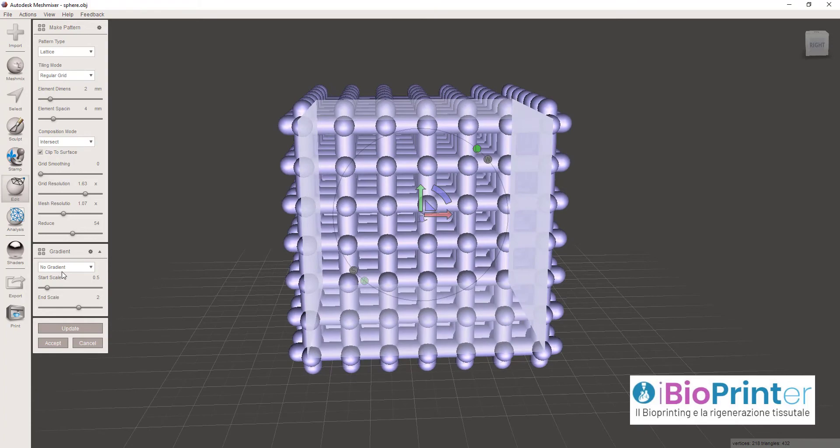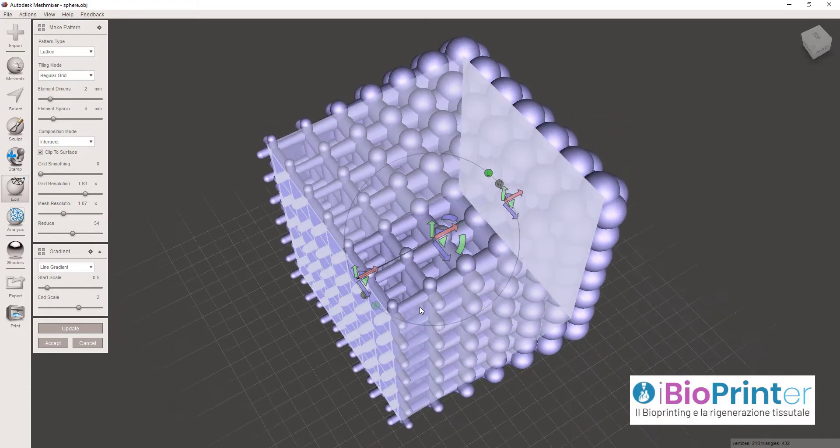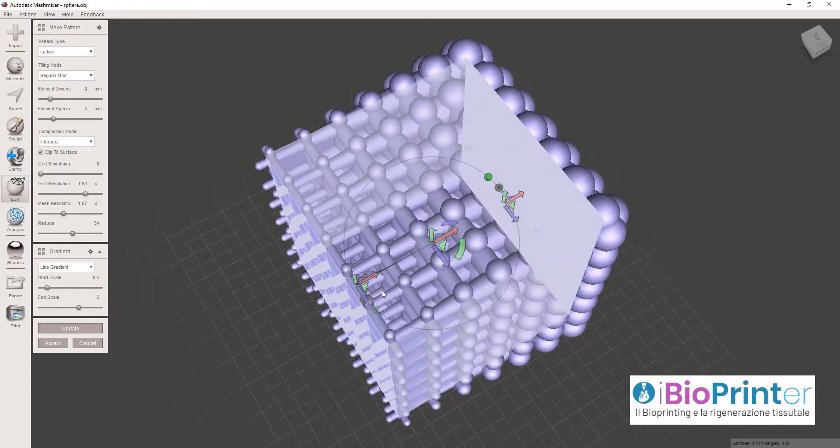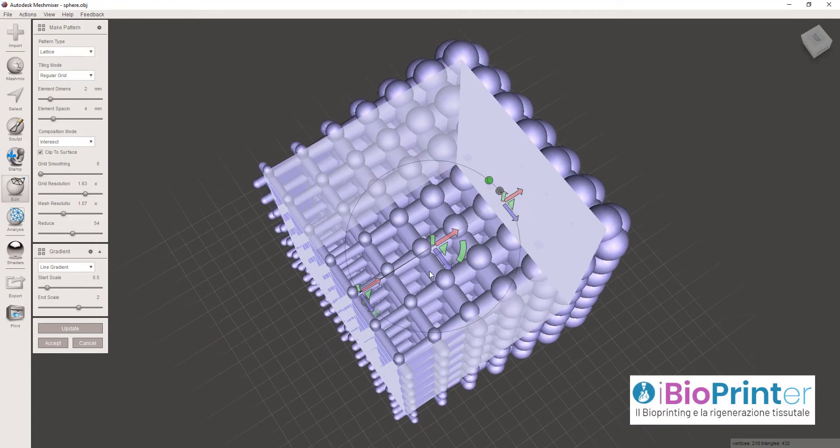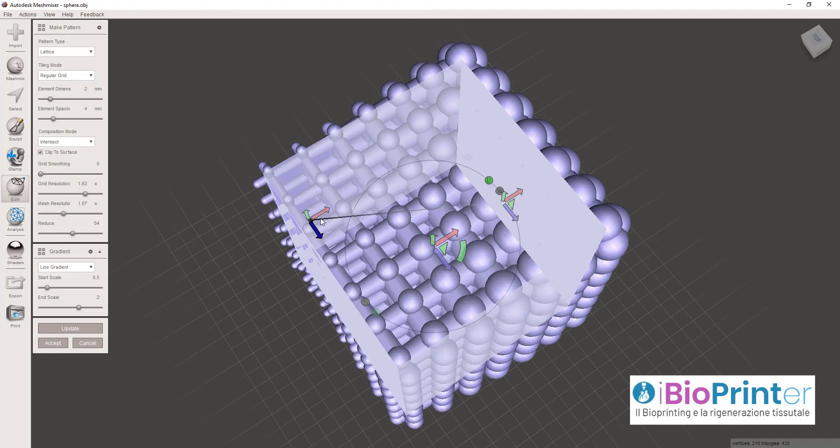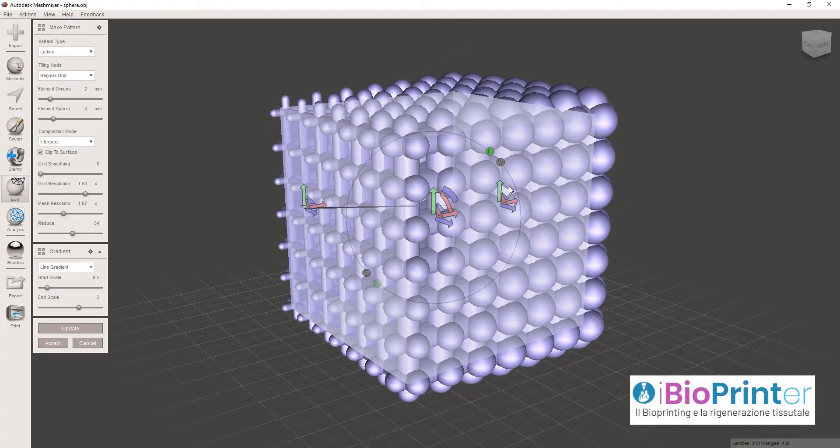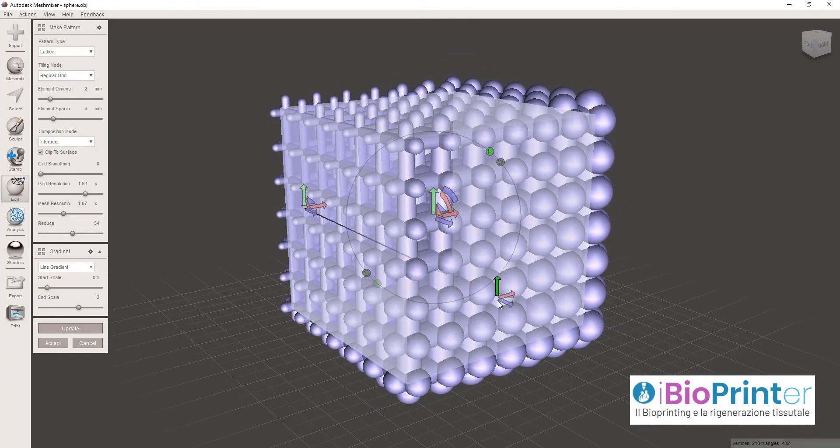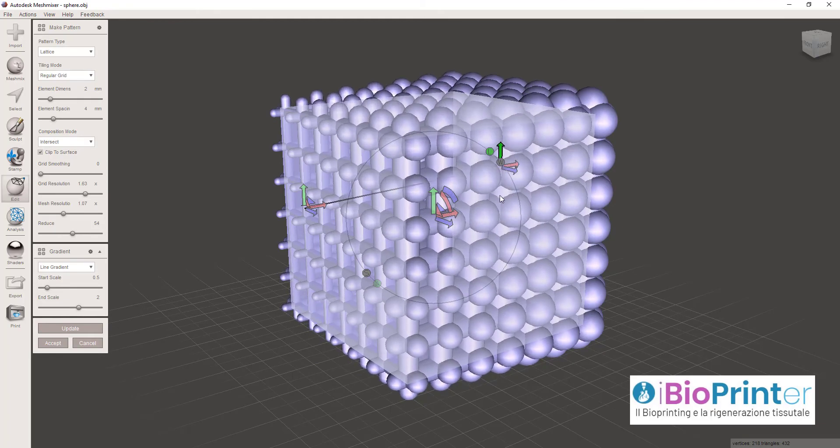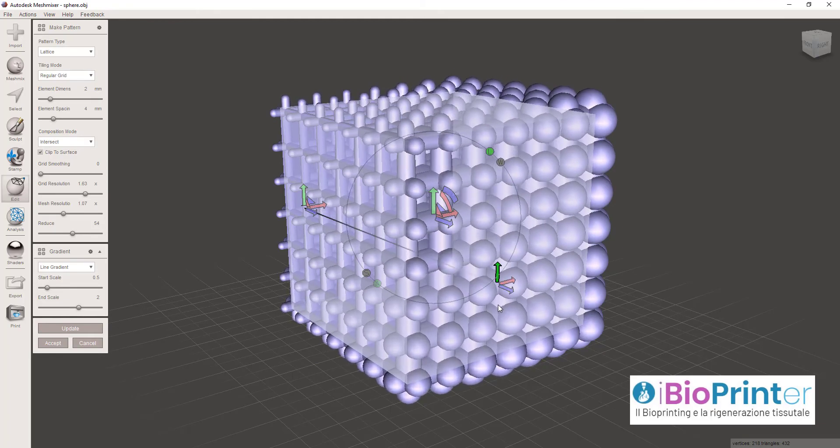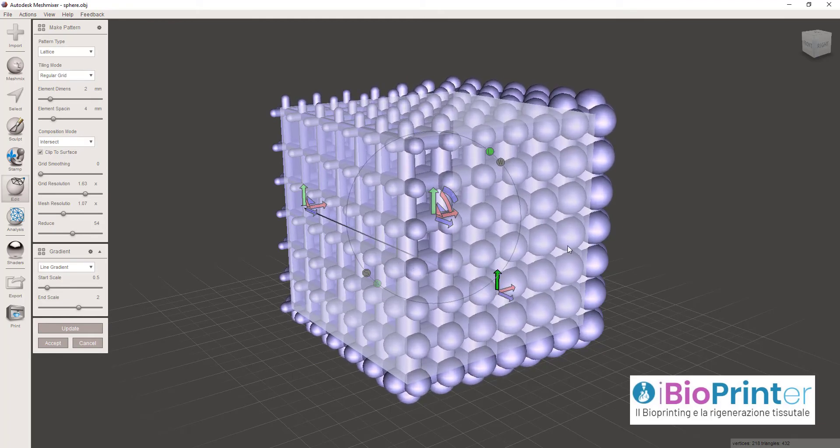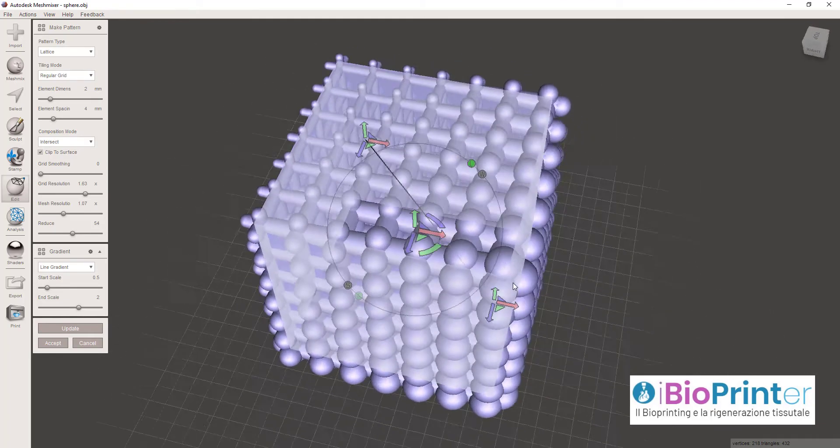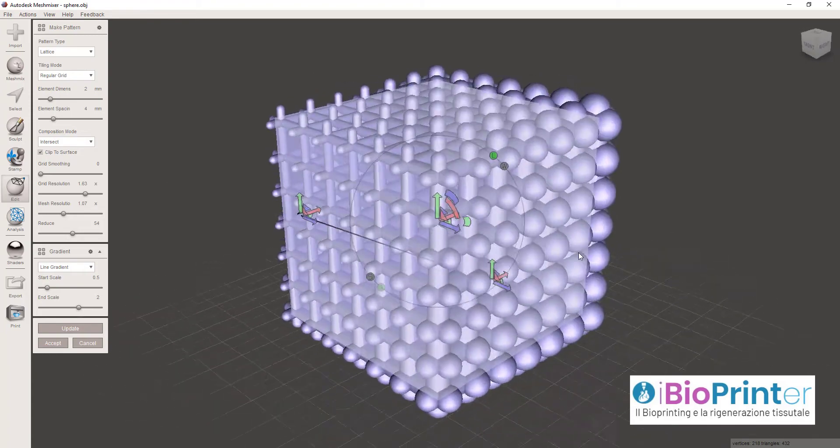Se noi clicchiamo su Line Gradient, vedete che compare sul nostro schermo un segmento di retta, con la possibilità di orientarlo nello spazio tridimensionale e modificare in corrispondenza della posizione di questi punti del segmento le dimensioni del nostro scaffold.